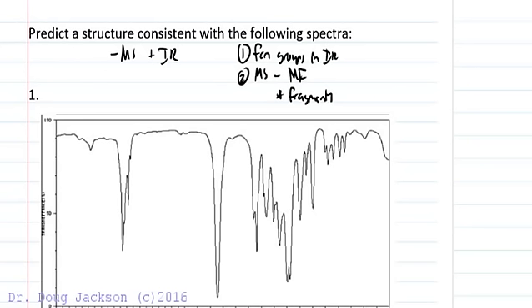Try various structures and through process of elimination, find one that fits most accurately to these spectra. The struggle helps teach you, and the key can show you where you've made incorrect logical assumptions about putting the pieces together, because this really is just solving a puzzle.